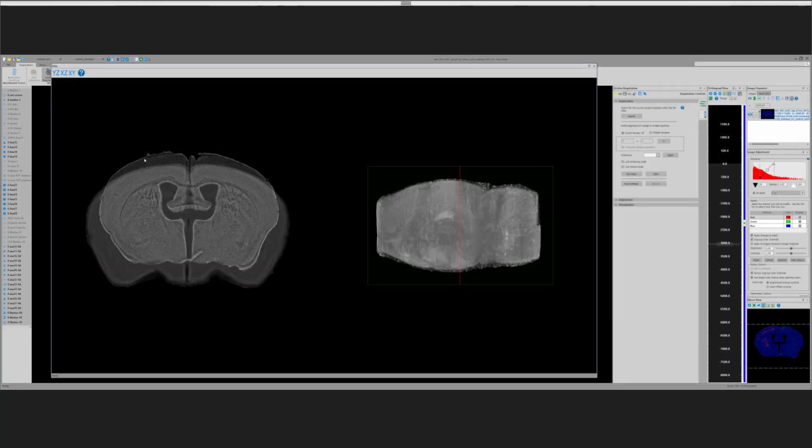So when we do that, it opens up new windows. These windows allow navigation through the Allen coordinate space. One thing I should say is that when we register to the Allen volume, the original Allen space was generated at the Allen Institute from over 1,000 brains that were averaged together. There were 2 photon images. There were block face images, basically coronal block face images through the whole brain. And that was what was used to generate the coordinate system of the Allen Common Coordinate Framework Atlas.